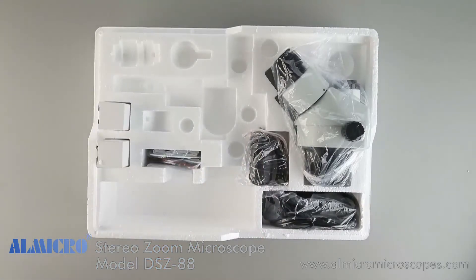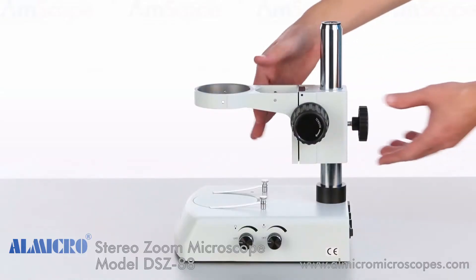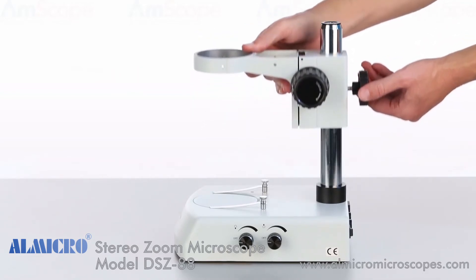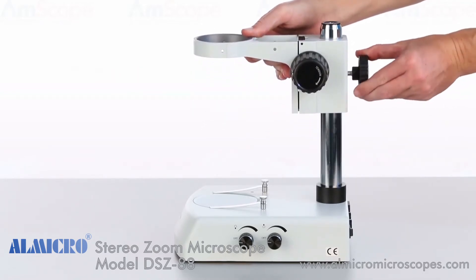Let's start with the body. The coarse focus is set by raising and lowering the focusing rack. Once it's in place, secure it by turning the rear locking knob.